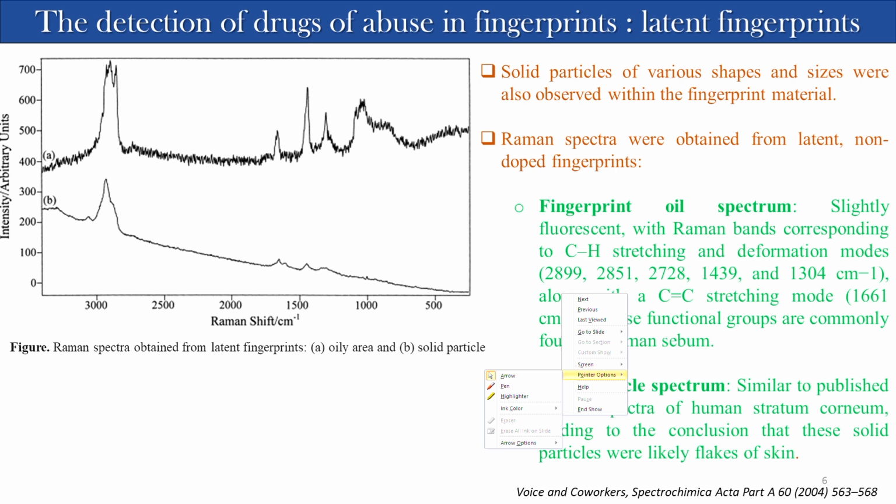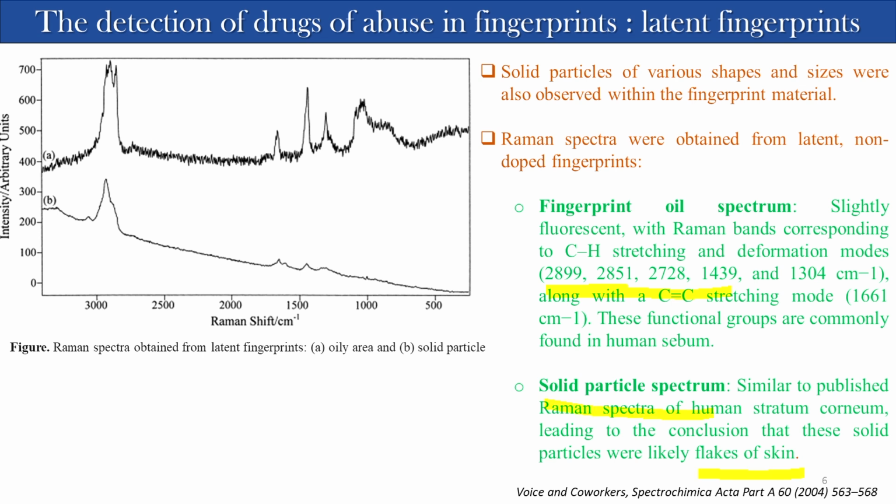These are the peaks. You have to know which comes from the oily sample, and the solid particle pattern. This one is the flake of the skin that I have told you.